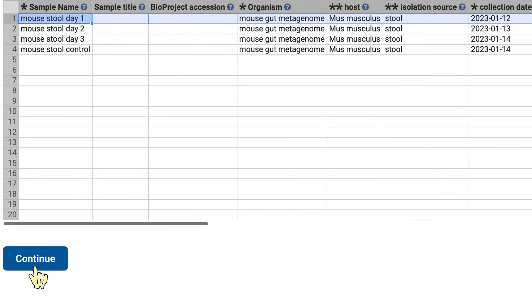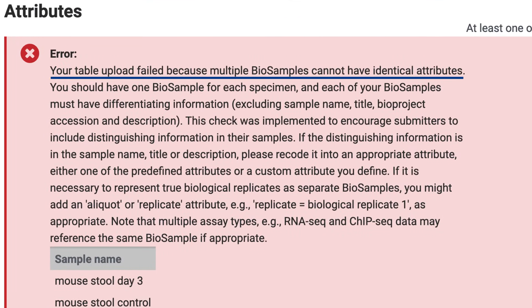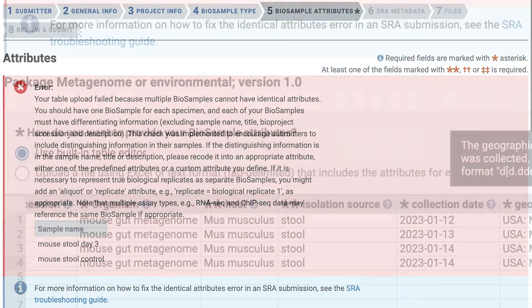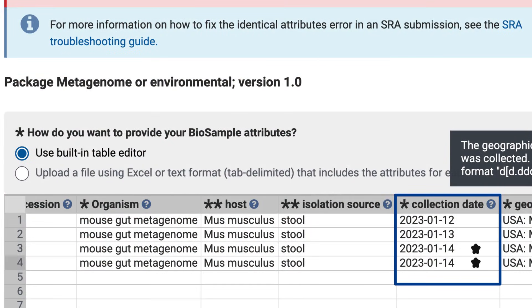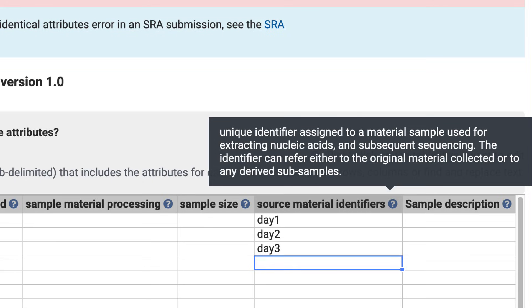Those are all of the required fields, so I'll click Continue, and I see this error message: your table upload failed because multiple biosamples cannot have identical attributes. In brief, each of your biosamples must have differentiating information, excluding sample name, title, bioproject accession, and description. My collection date was the same for day 3 and the control, so that was the cause of the error. One solution is to enter values in the source material identifiers column. I'll add day 1, day 2, day 3, and control. Now no rows in the table have identical attributes. I'll click Continue to run the check again, and I'm ready to continue to step 6, SRA metadata.